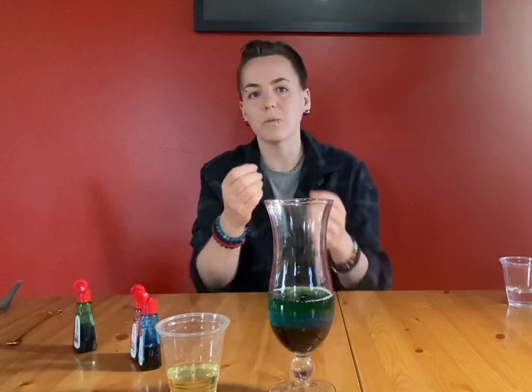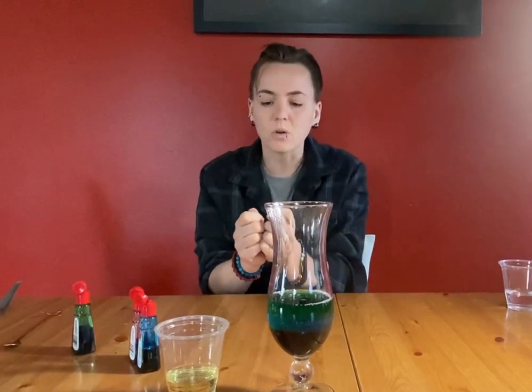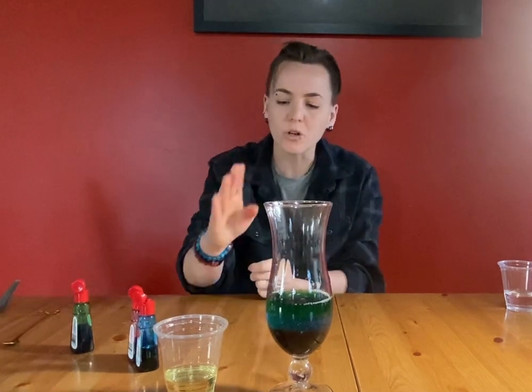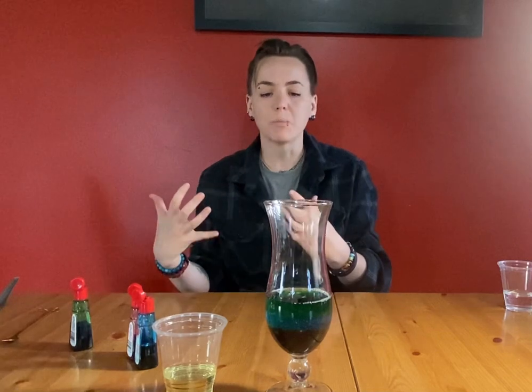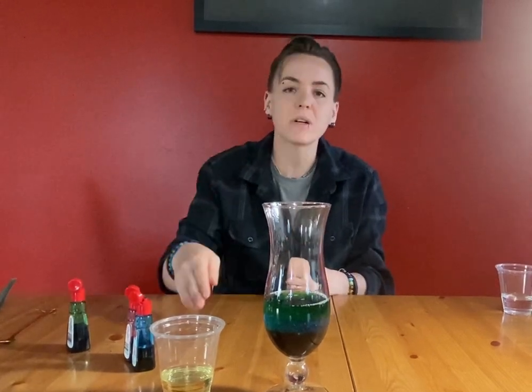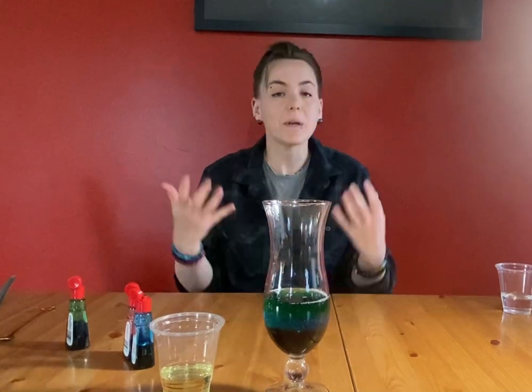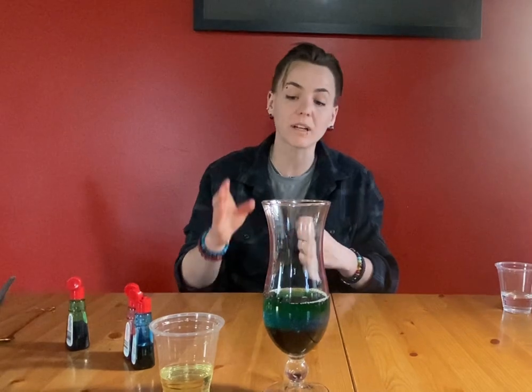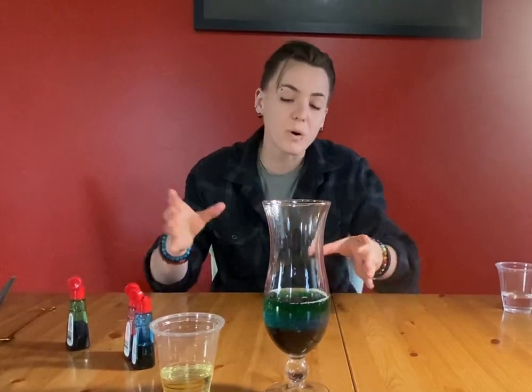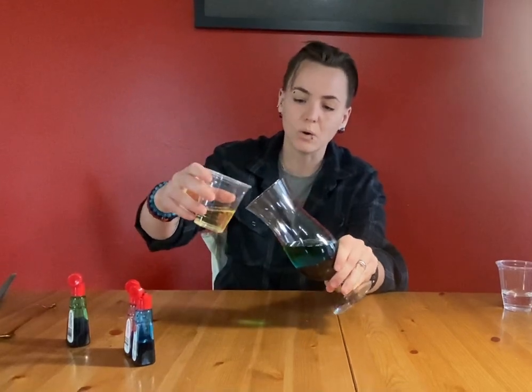Canola is an oil. So if they grow these tiny little seeds and you can crush them, you'll see oil. So that's how this is made. And we could dye it yellow to make it more vibrantly colored, but because of the different properties that canola oil has, and that oil in general has, it doesn't like to mix with color. You could try to add a few drops of color to this and it wouldn't actually work. And we can discuss that at a different point in time with a different experiment, why exactly oil is that way.